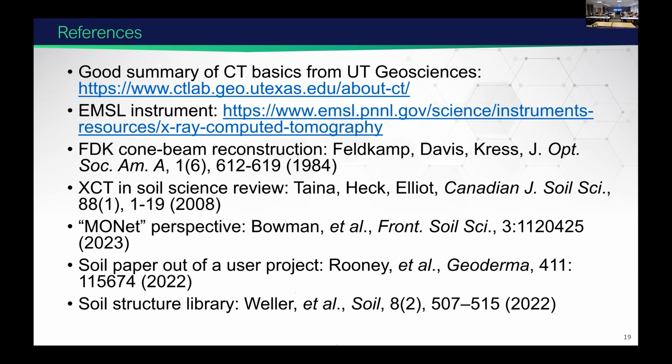I want to finish with a few references that you can look at. A good summary of CT basics information can be found at this University of Texas CT Lab website that I like. The second link is our EMSL link to our CT scanner, also contains some good basic information about resolution and scan considerations. The third paper is the theory paper of the FDK reconstruction I mentioned, if somebody wants to get into it. I listed a pretty good soil science XCT soil science review.